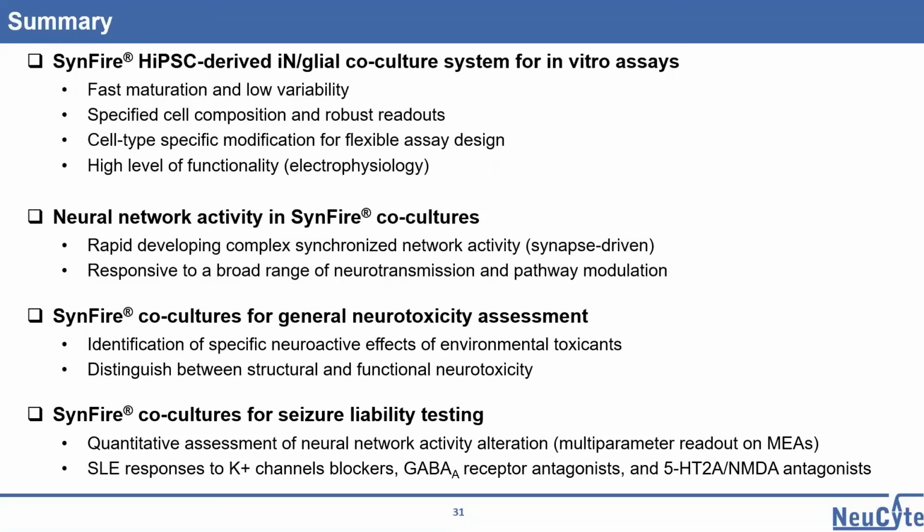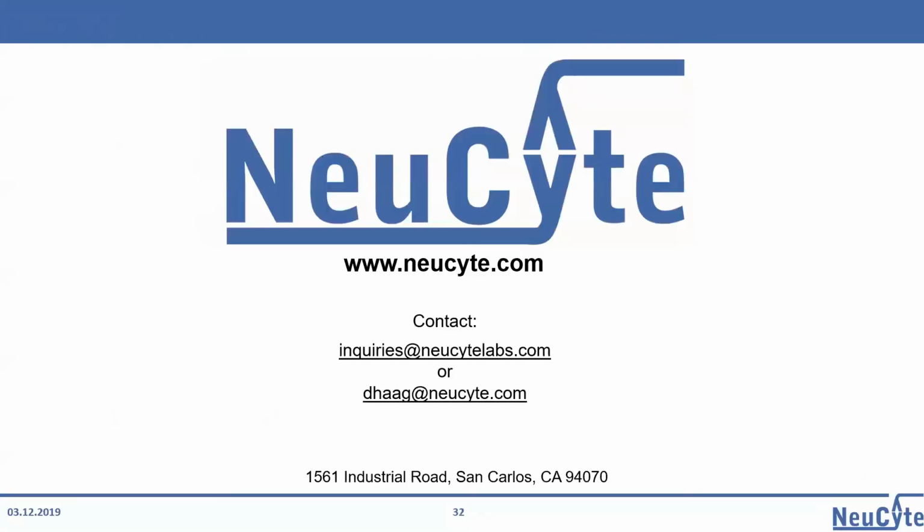And the same holds true for the seizure liability testing. We are in the process of expanding our applicability and the definition of the applicability of our assays. But I think with in vitro assays we're on the good way to complement mouse studies and to hopefully soon end up with a panel of in vitro assays that are capable of robustly and reliably predicting seizure liabilities in vitro. Okay, with this, I think I would conclude.